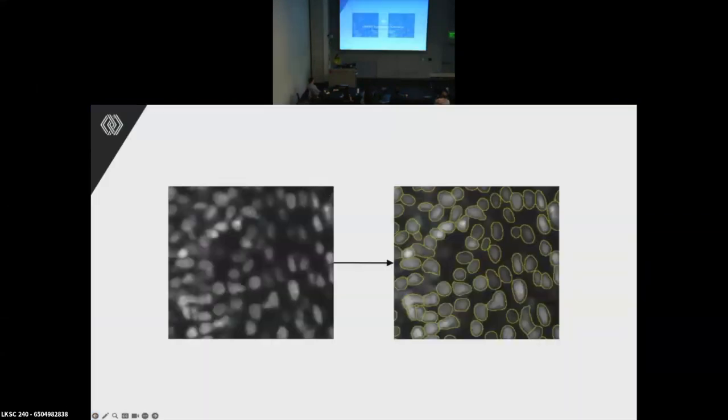So just to frame the problem that we wanted to solve, we want to take this image on the left and we want to get the image on the right, which is, in this case, a nuclear segmentation. You can imagine your preferred segmentation, but here it was the instance-based nuclear segmentation. And the challenge is that the image on the left is massive, like we described earlier. So, we've got, let's say, 100K by 100K pixels. We're not going to load the entire thing into memory and run our segmentation because not only do we have one image of that size, but we have 500 images of that size. So how do we run this except on a very beefy workstation that we book for a week of time in order to run that segmentation?